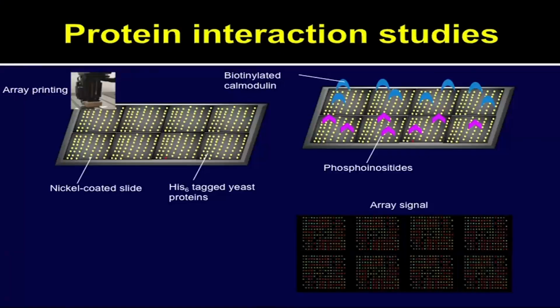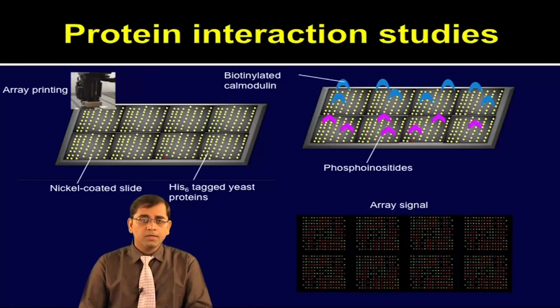Let us now discuss case study 2. Analysis of yeast protein activities using proteome chips. In this study, Zhu et al. cloned 5800 open reading frames from yeast and overexpressed and purified these proteins to build the yeast proteome microarrays.